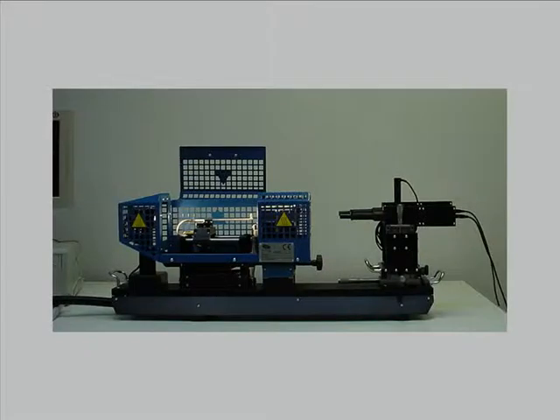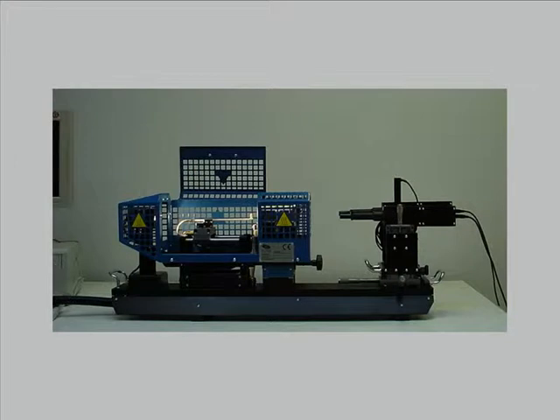Welcome to this short presentation of the double beam optical dilatometer MISURA-HT. The double beam optical dilatometer was first developed by Expert System Solutions in 1999 and is protected by two international patents.